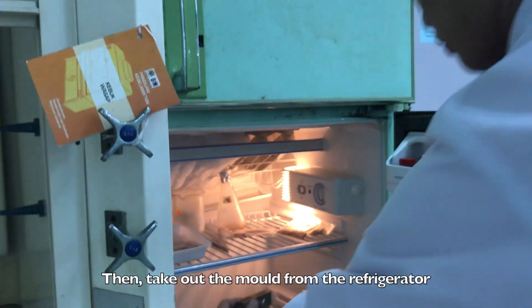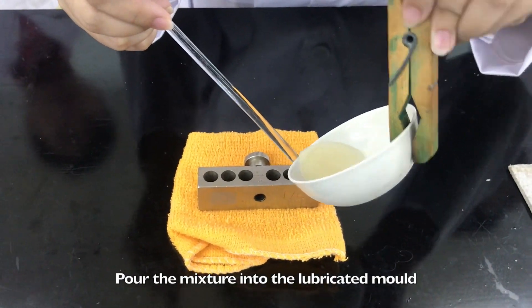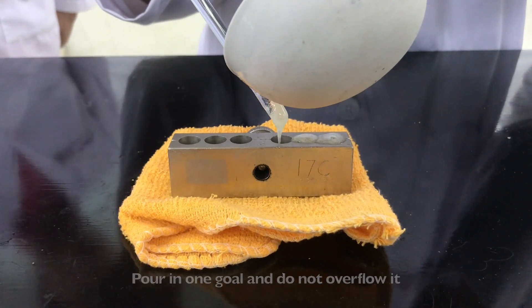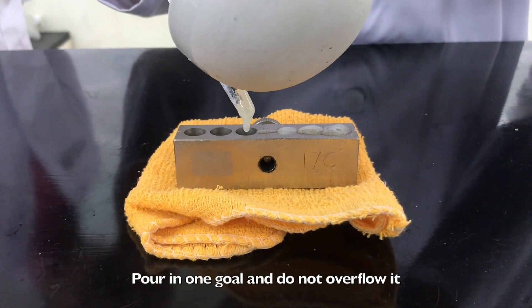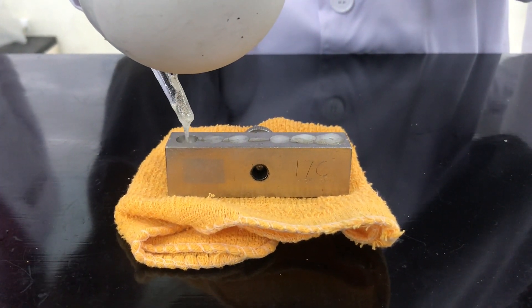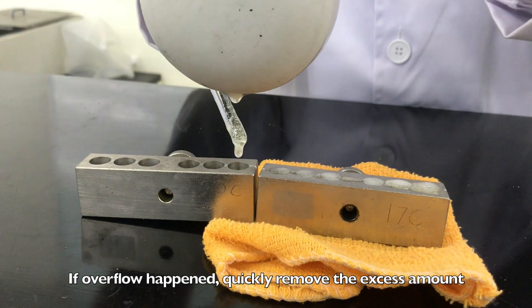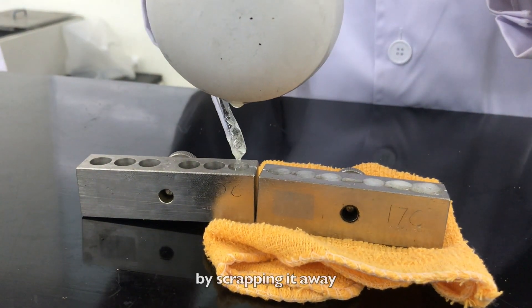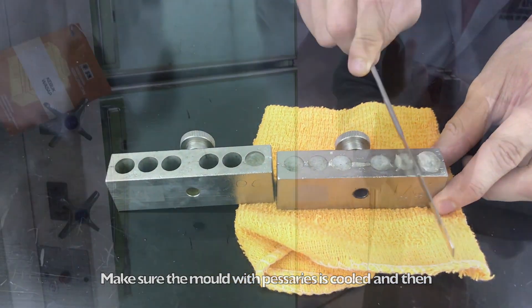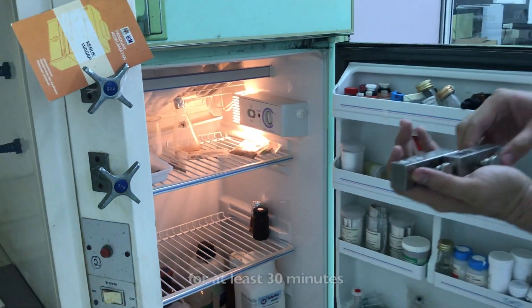Then, take out the mould from the refrigerator. Pour the mixture into the lubricated mould. Use a glass rod to guide your pouring — pour in one go and do not overflow it. If overflow happens, quickly remove the excess amount by scraping it away. Make sure the mould with the pessaries is cooled and then let it set in the fridge for faster solidifying for at least 30 minutes.